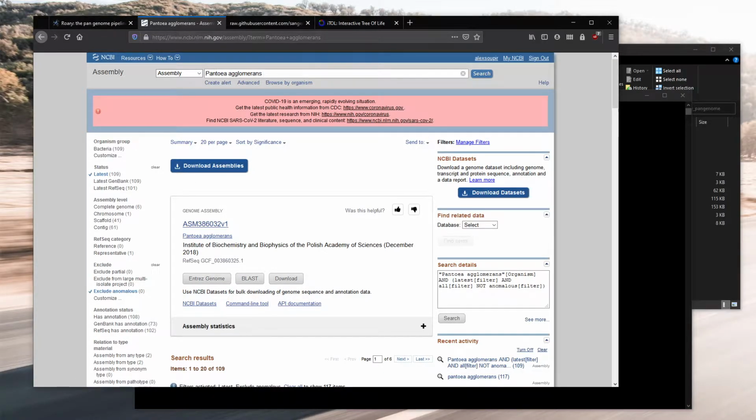In my case, I chose latest RefSeq and I unchecked latest. I don't know how much that really matters since this is just playing around. From there I selected the assembly levels: complete genome, chromosome, and then contig. I didn't pick scaffold because there's 36, I think, here, and that would take 1.5x longer to run, and it already took a really long time to annotate all the genomes.